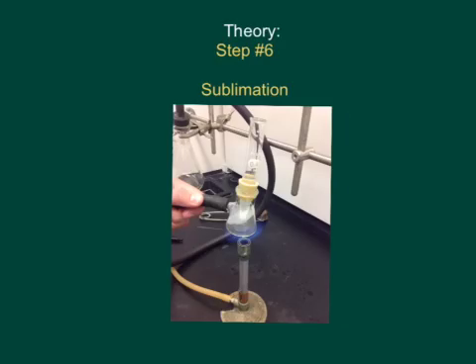Now, caffeine has a very specific property that will let it sublime, basically stating that it could go from a solid straight to a gas form or a gas form straight to a solid form. As shown in this system, we sublime caffeine and we're allowing caffeine to be even further purified because caffeine is the only substance within this mixture right here that will sublime. We're able to further purify away any impurities and just isolate caffeine by itself on the pipette test tube as shown here.